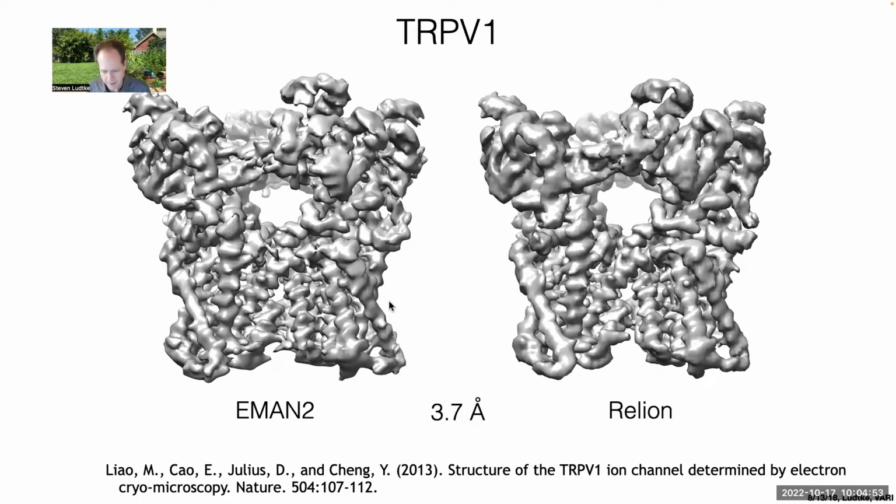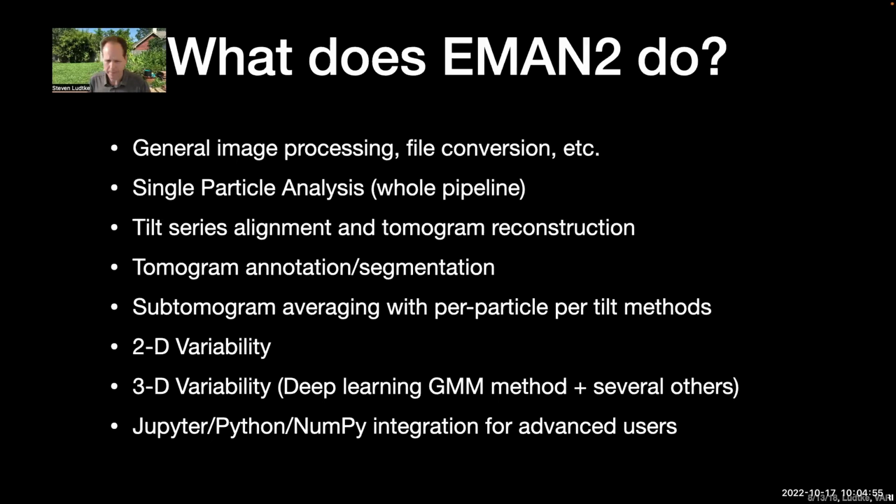So, all right, what can you do with EMAN2? Even if you don't want to run single particle refinements in EMAN2, it's a very nice package for doing sort of generic image processing, file conversion, filtering, masking, all sorts of stuff like that. So it's a nice toolkit.